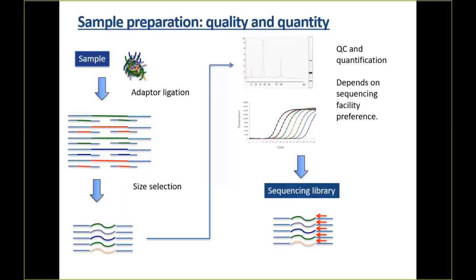The other thing is cores tend to be very strict with their library preparation SOPs. So, for example, if I have a grad student in my lab preparing a library, and then I have another grad student preparing a library, and both those grad students over their entire careers are going to just do about 20 library preps total, there's probably going to be some technical noise introduced by the fact that neither of them do a lot of library prep, and worse than that, both of them might have some slightly different habits when it comes to library prep.